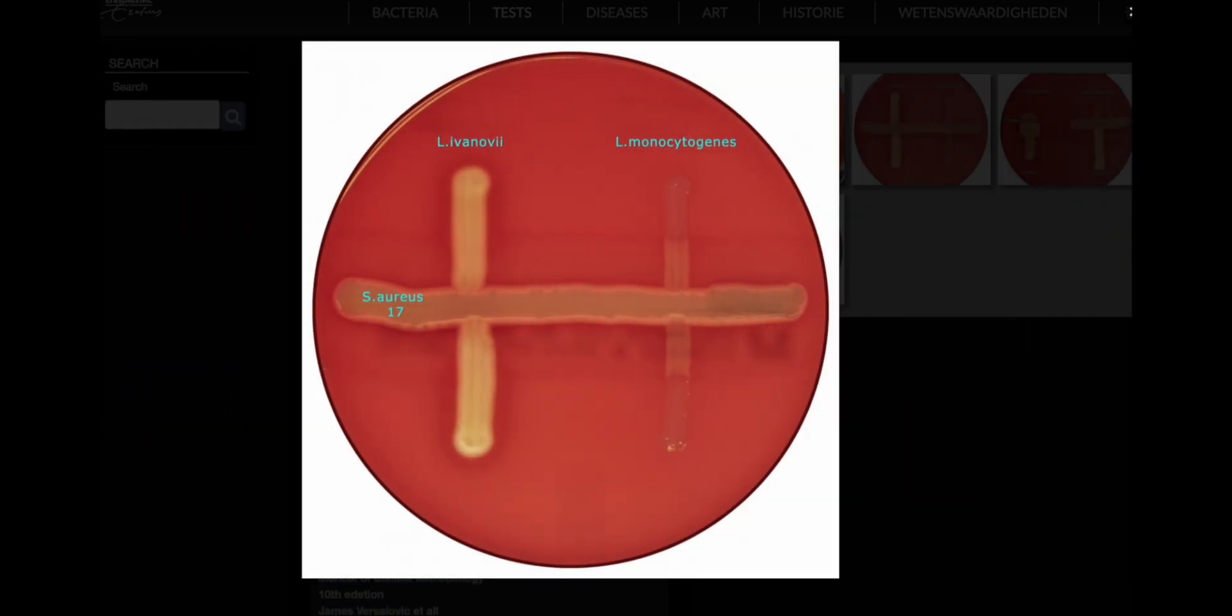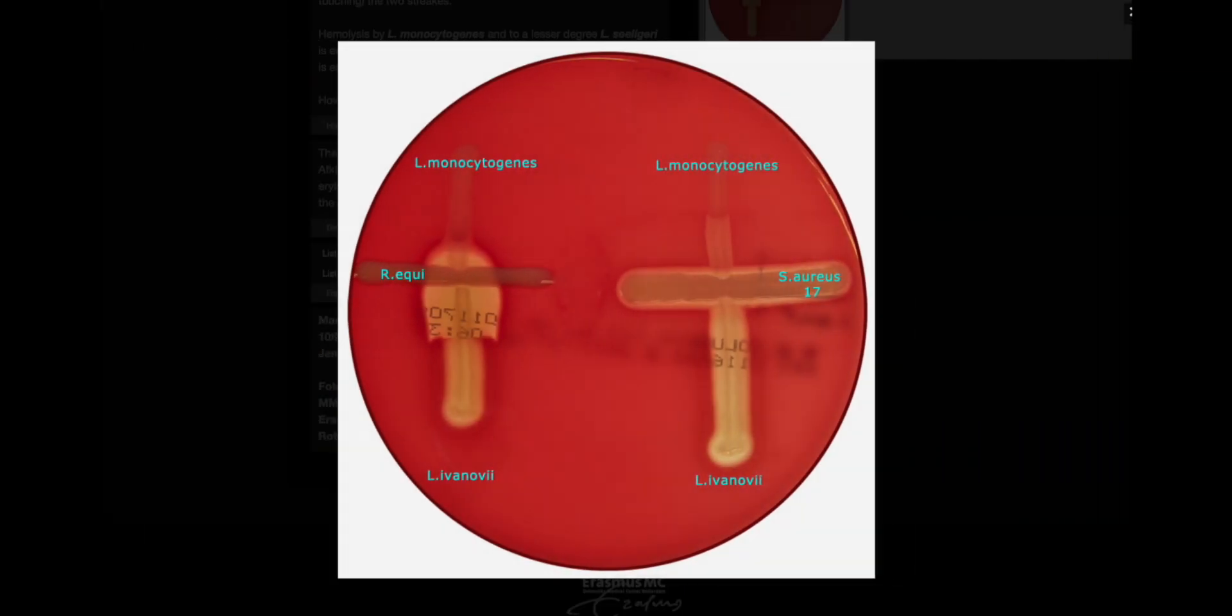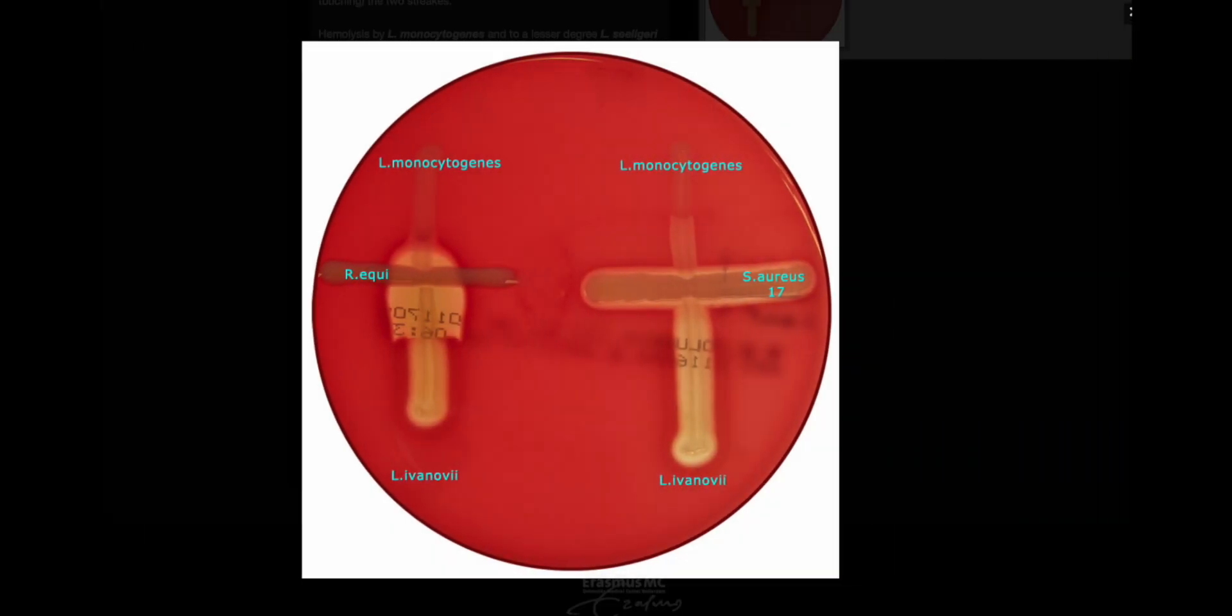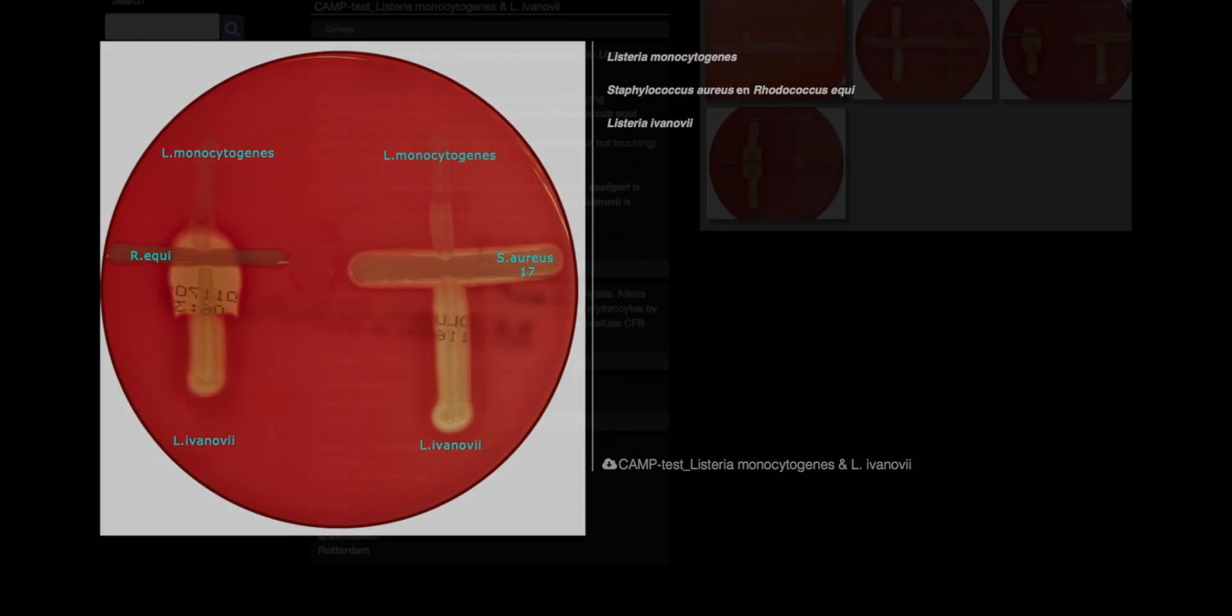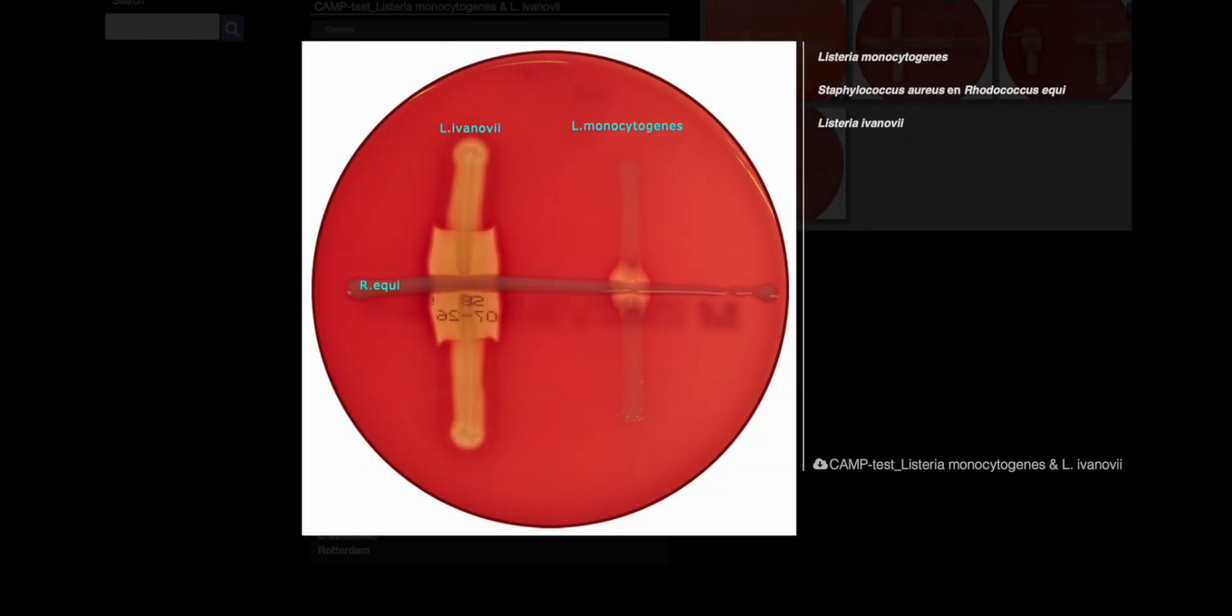To conduct this test, a beta-hemolysis producing Staphylococcus aureus ATCC 25923 strain and Rhodococcus equi are streaked parallel to one another on a blood agar plate. Suspected cultures are then streaked perpendicularly between, but without touching.